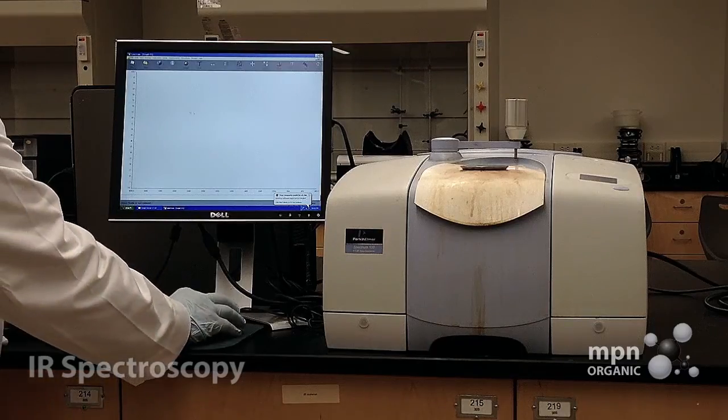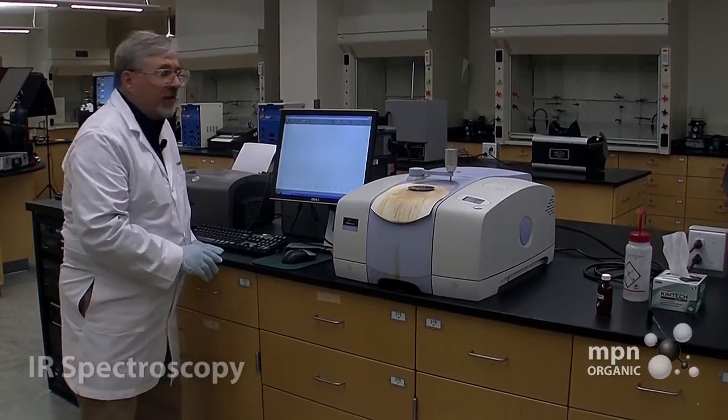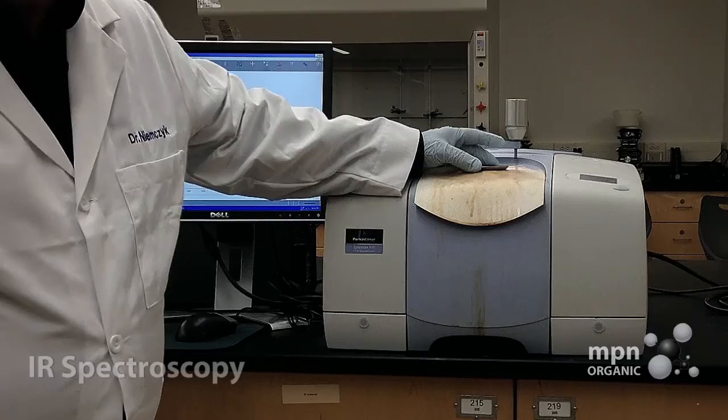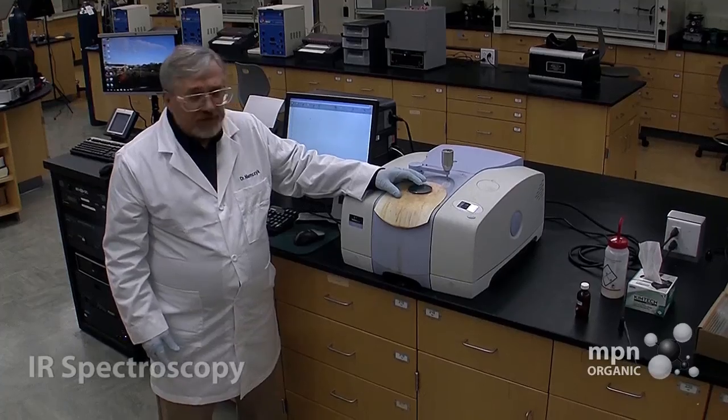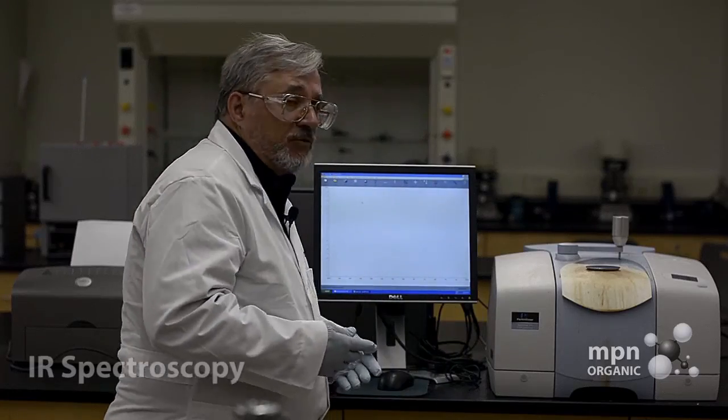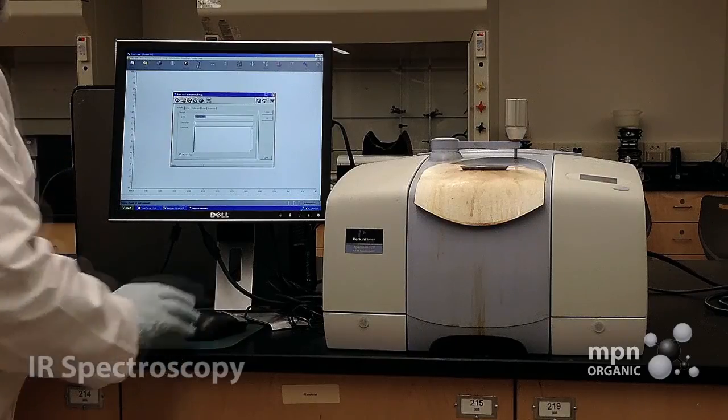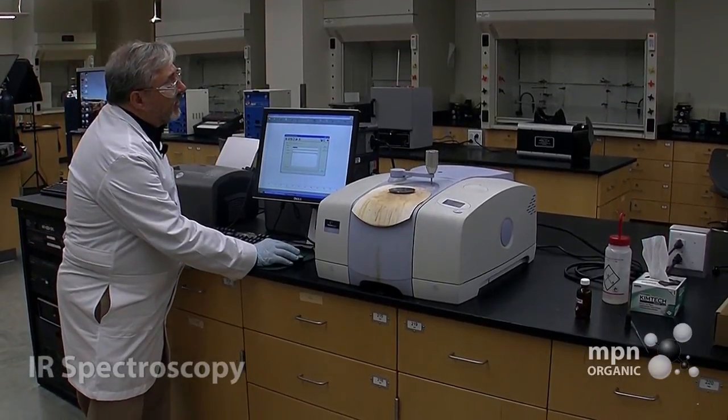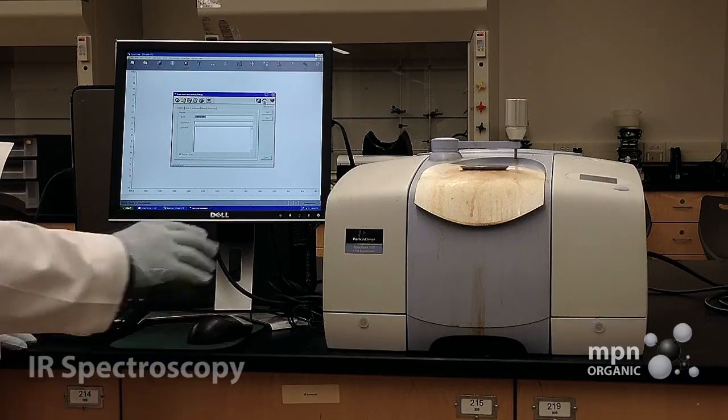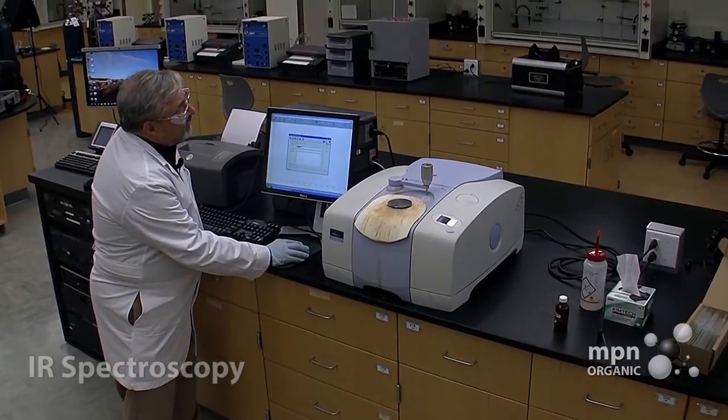Here's our screen, and there's some icons here at the top which we're going to use for giving us an infrared spectrum. The first one that we have to take is a scan of what we call the background. Now we have this disk over here, and it's got in the middle of it a little bit of diamond material in it. And we have to take the background of it, which will be subtracted then from all of the infrared spectra that we take. So we go to scan. We come to this particular window, and then over here in the upper right, we have an icon that looks like an eye with an eyebrow. And if you land on it, it says background.